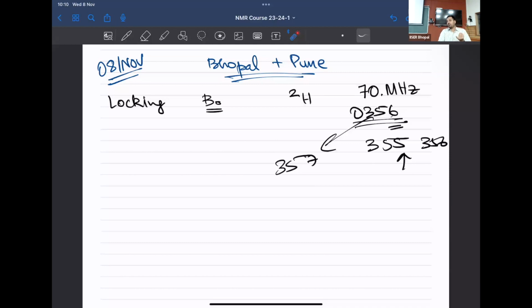You can't do it with carbon. If you do it with carbon, you can't measure carbon data. You can't do it with nitrogen, in which case you can't measure nitrogen. You definitely cannot do it with proton because you want the proton data. So you wanted a sacrificial goat in this regard, and you let it be deuterium. That's about it. Okay.